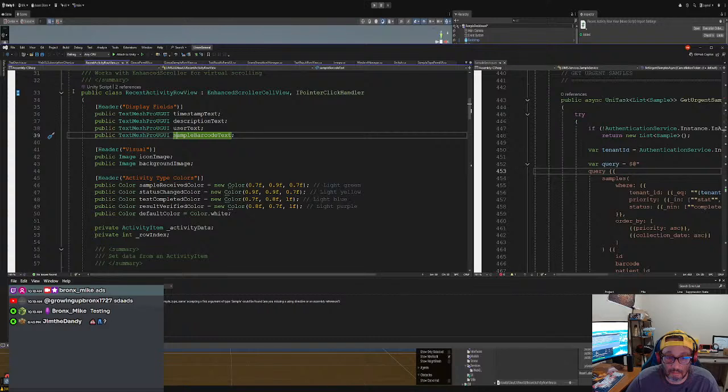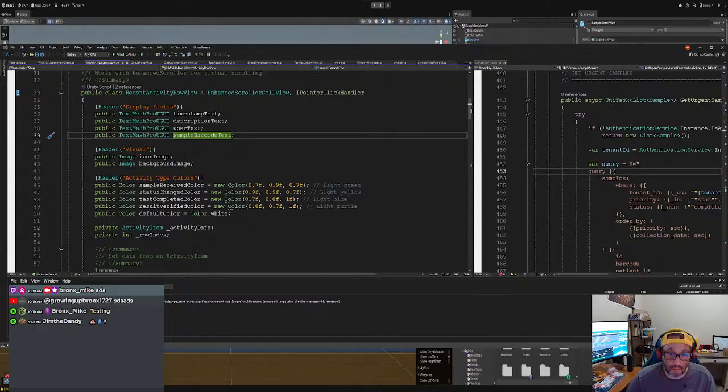4 of them, right? So what we're gonna do is go here, do that again. Make sure we're on the prefab. We're gonna do a recent activities folder. Did I spell that right? Make sure it's here. There we go. All right. So now, what was it? 4, right? Yeah, 4.